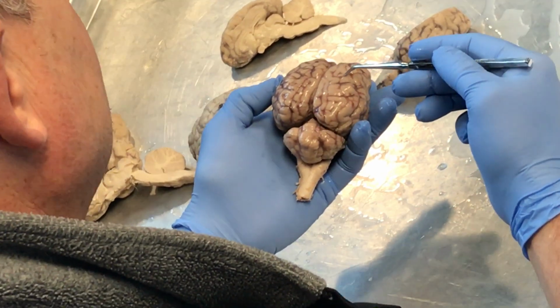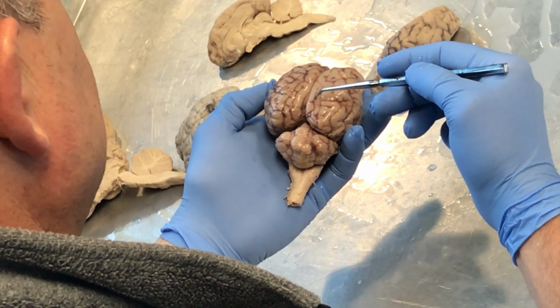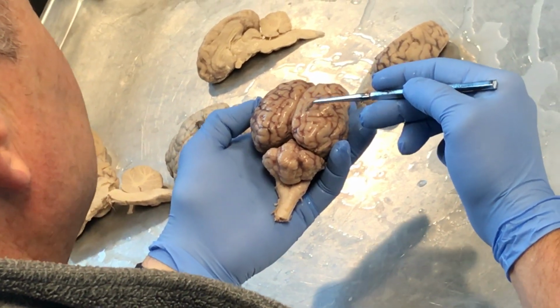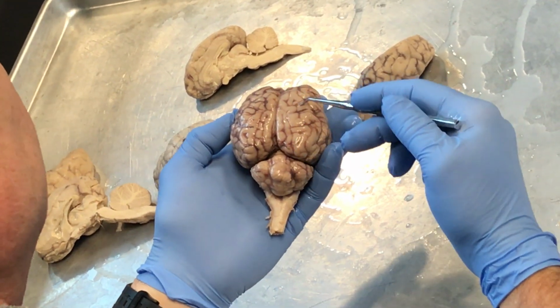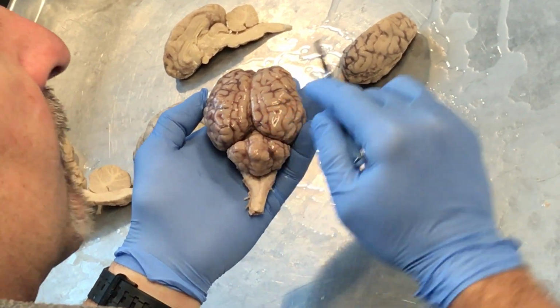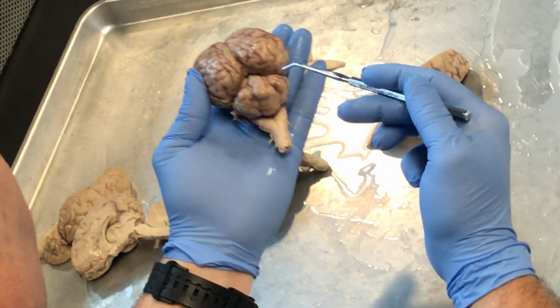Individually, all the hills are called gyri, and the depressions in between the gyri are called sulci. So the hills are gyri, the sulci are the valleys. Cerebral hemisphere would be one half and the other half. Cerebellum is back here.